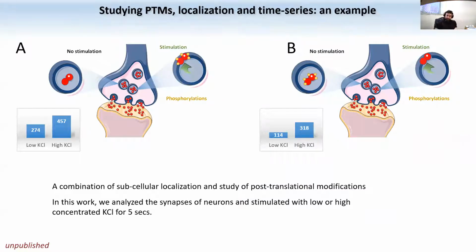Right, and this is just an example to tell you how, when you combine all the properties that I told you so far, it can become extremely informative. So this is just a study, very briefly, where we took synaptosomes, so the end of the neurons, that's where the information is transferred between cells. And then the synaptosome was stimulated with the salt that is supposed to activate it, and activate the ion channels. So if you purify these synaptosomes and you study protein abundance and protein modification, here of course we focused on phosphorylation because they are the fastest modifications that are transferred between vesicles.